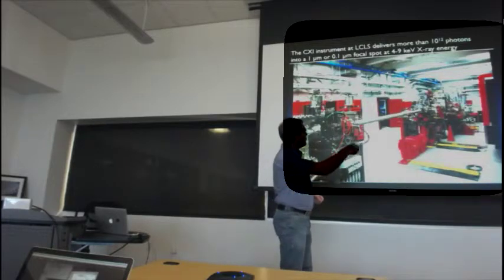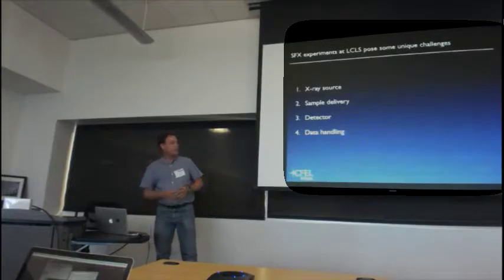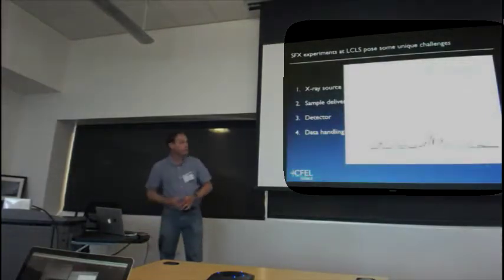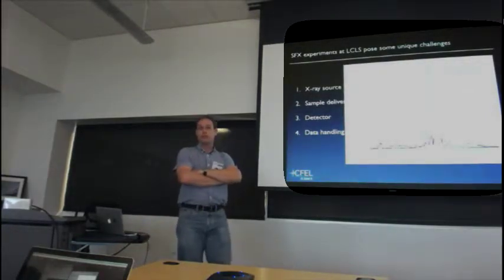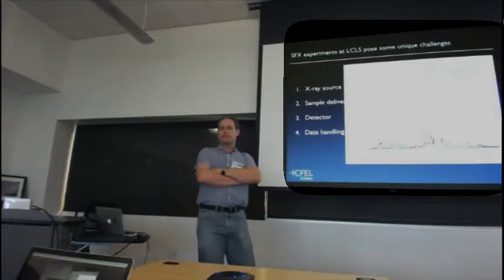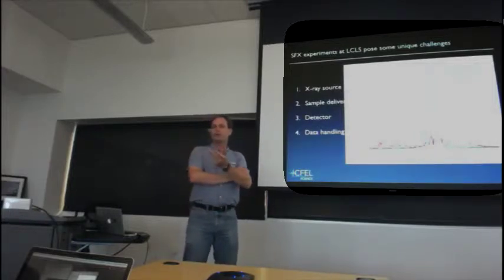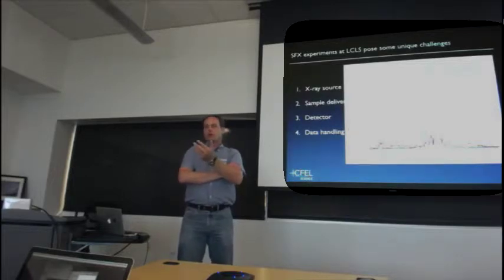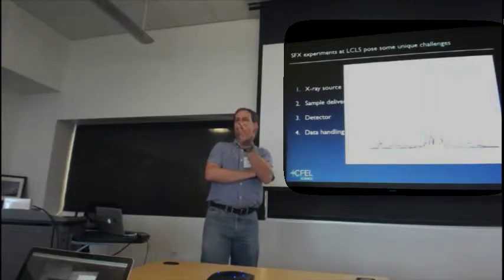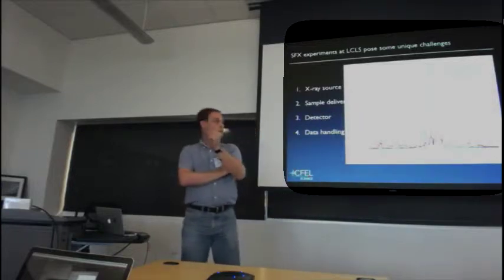What you do, you fire all that up, and then you sit in this little dungeon here, and you start to collect data. And you notice a couple of things that, as John mentioned, are really different. One is that the spectrum and the shots are fluctuating seriously from shot to shot. So the control freak experimentalist at a synchrotron tries to have the most stable beam, the most stable wavelength, the most stable goniometer, the best everything to control all the experimental conditions as much as possible, so that the only thing that is changing is the crystal orientation, and this enables you to do very nice error analysis and very nice analysis of the data.